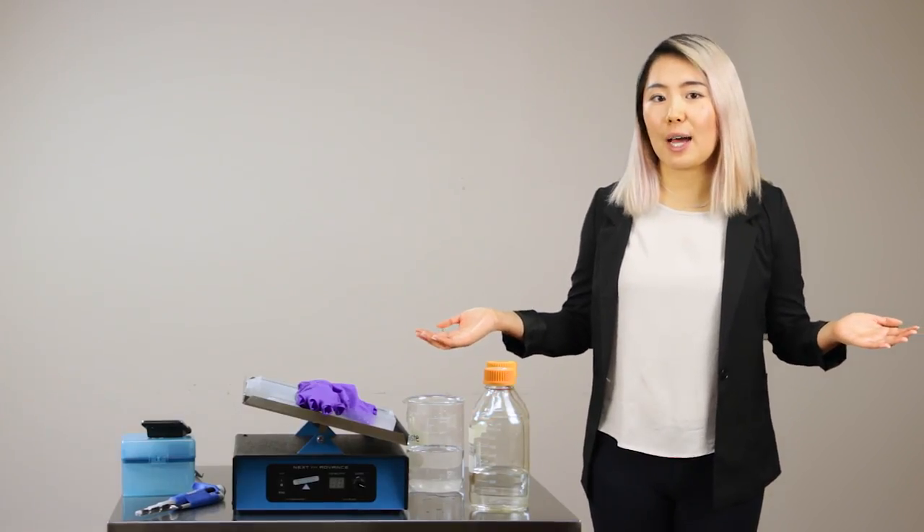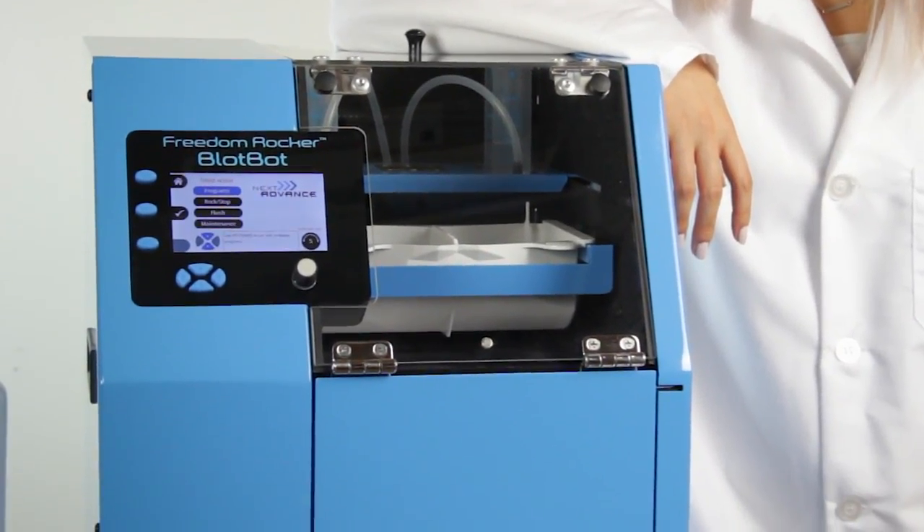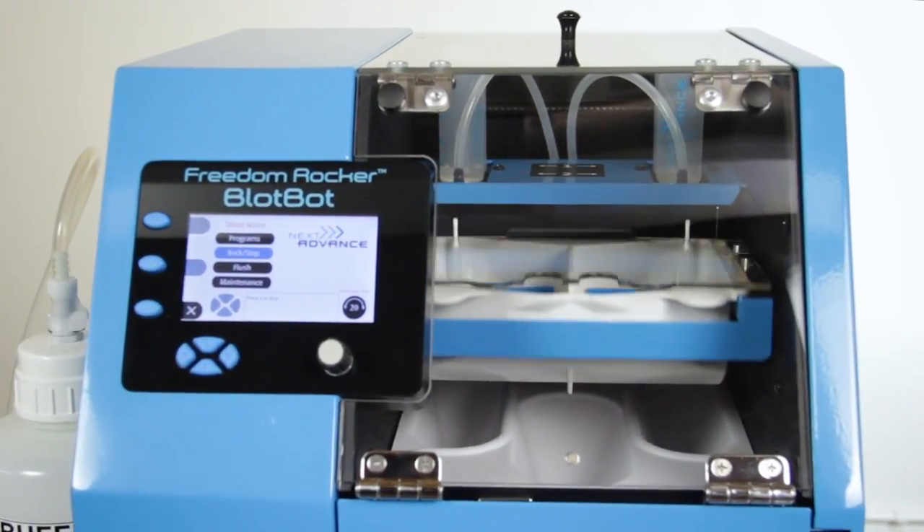Ready to revolutionize your lab? Introducing the BlotBot. It's the newest addition to the Freedom Rocker product line, which has been helping researchers since 2005. The BlotBot is a programmable system designed to automatically dispense buffers and reagents into trays for washing and processing.